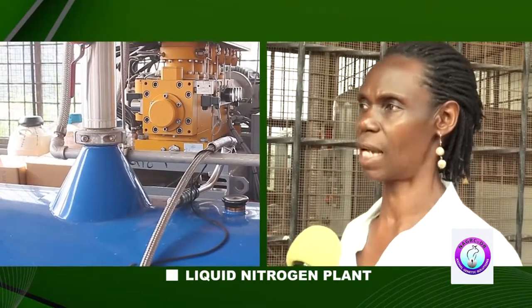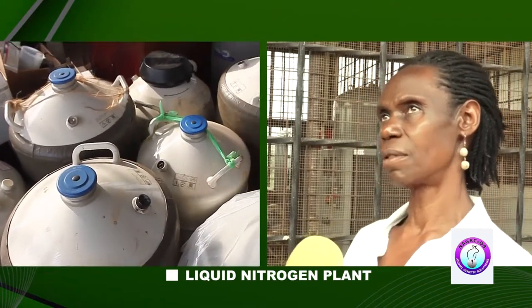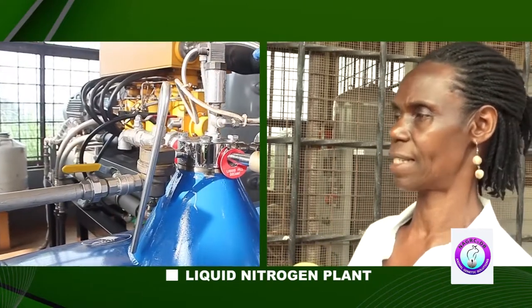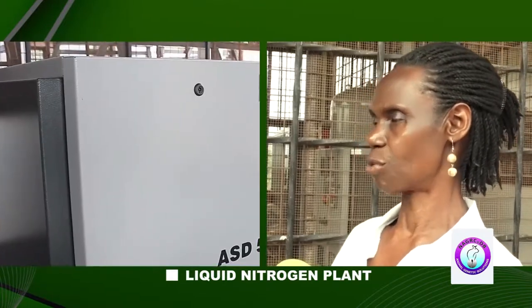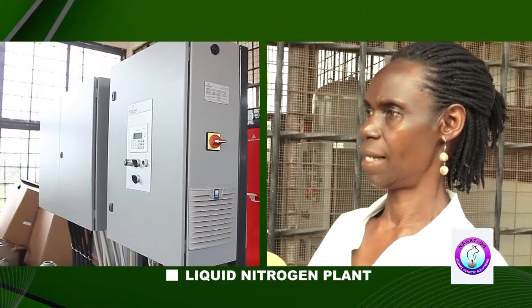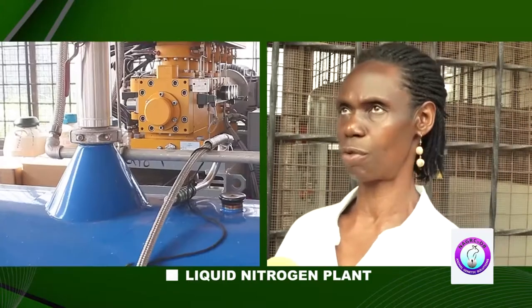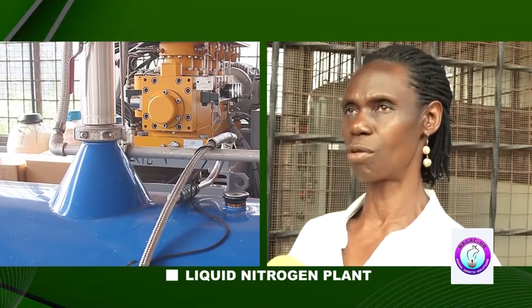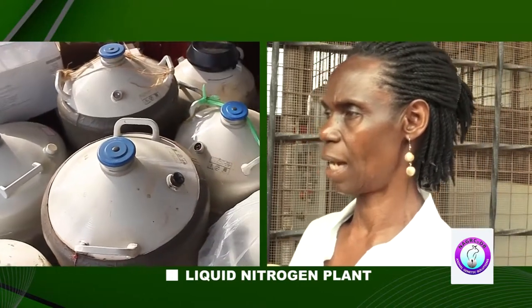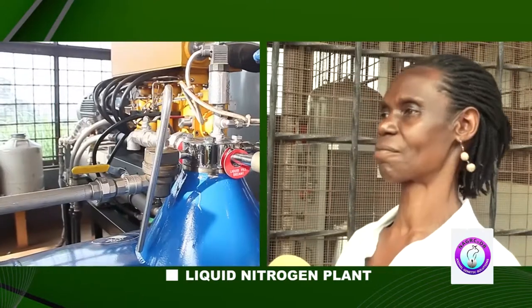Then the gas continues ahead, and we remove the oxygen. We remove the carbon dioxide. We continue with nitrogen gas and inert gases. It is stored in another place whereby it is ready to go into the cryogenerator. The cryogenerator has some small tubes because inert gases are very small. So they are drawn off in a tube and we remain with dry nitrogen gas.